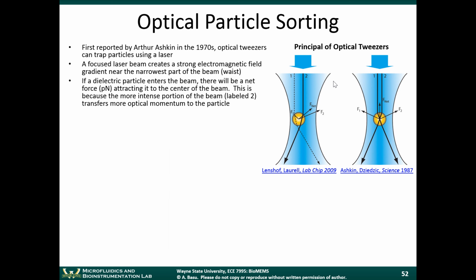So first of all, the principle of optical tweezers. I mentioned that if you have a focused laser beam, that is a focused electromagnetic source of energy. So these electromagnetic forces, though they're not very strong, for very small particles they can be used to manipulate particles. If you're interested in this kind of thing, just look up optical tweezers on Wikipedia or something.